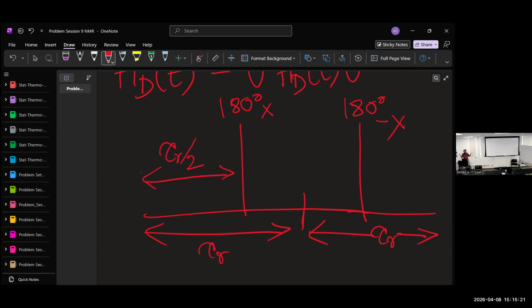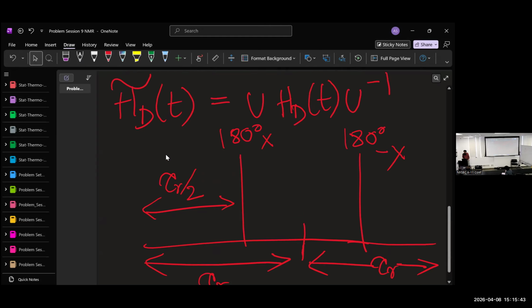Okay, this is how this pulse program is constructed. You have a rotor period, smack in the middle is a 180-degree pulse, and another rotor period, again a 180-degree pulse in the middle, and so on. You have one pi pulse for each rotor period, and this process is done any number of times, and that will end up in the evolution of the magnetization under the average Hamiltonian.